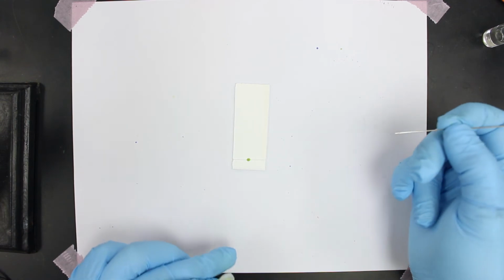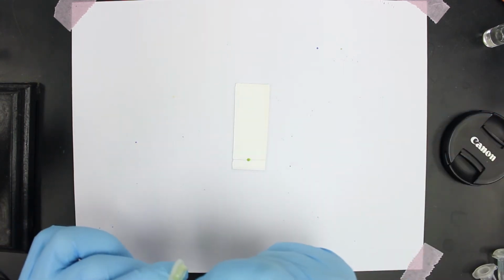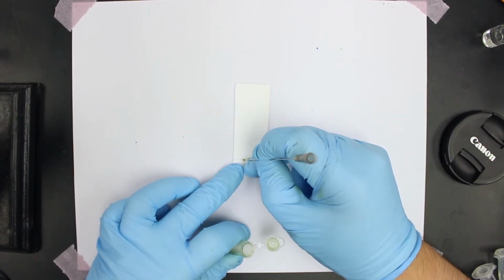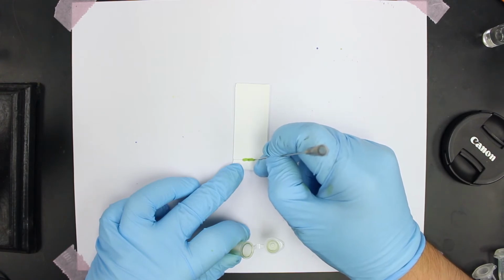Now, for a normal TLC, that would be sufficient. You don't want to apply too much compound. But in this case, because it's a very beautiful experiment, I think I will apply a nice band across the origin so you can see a nice separation.